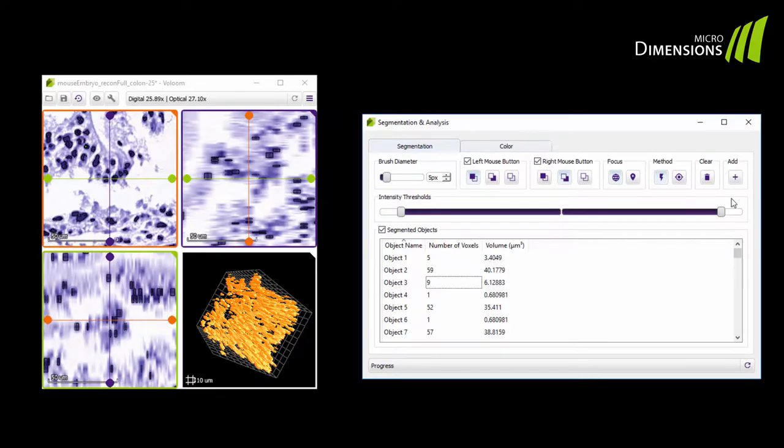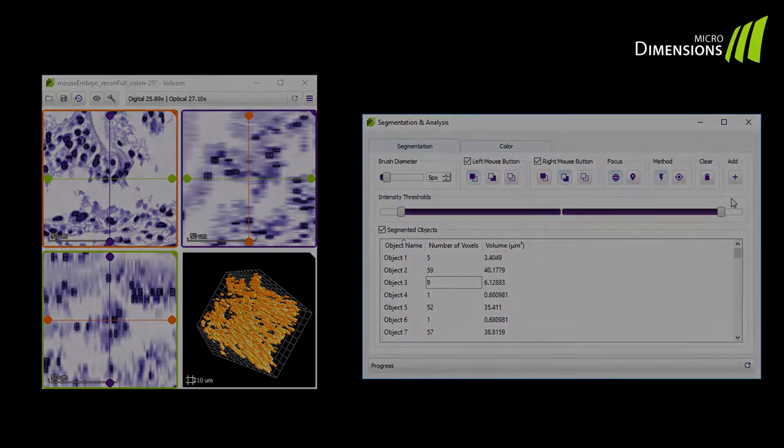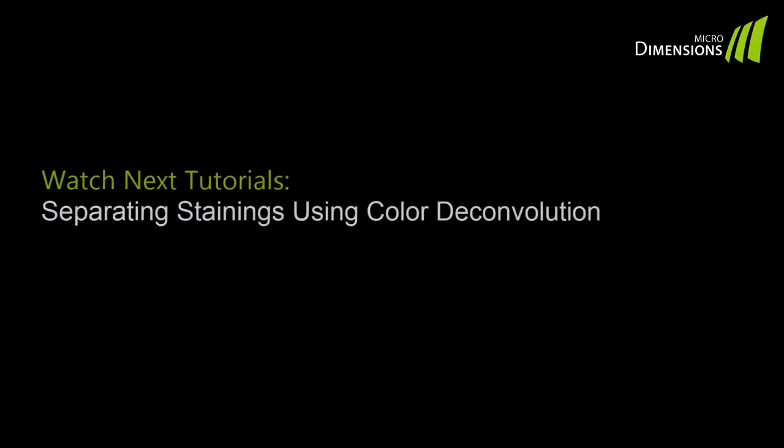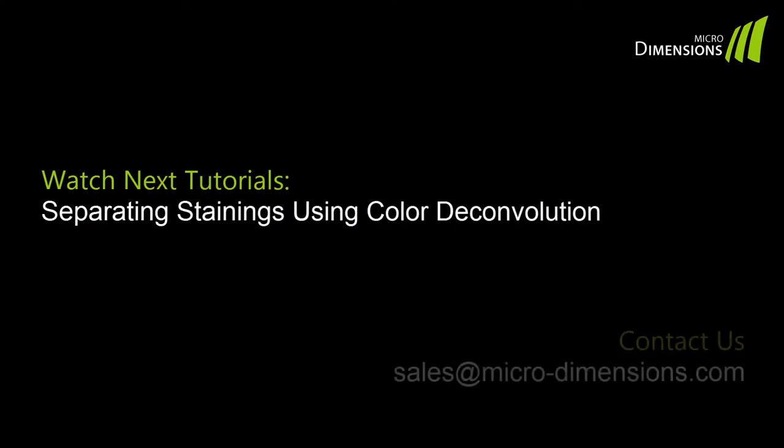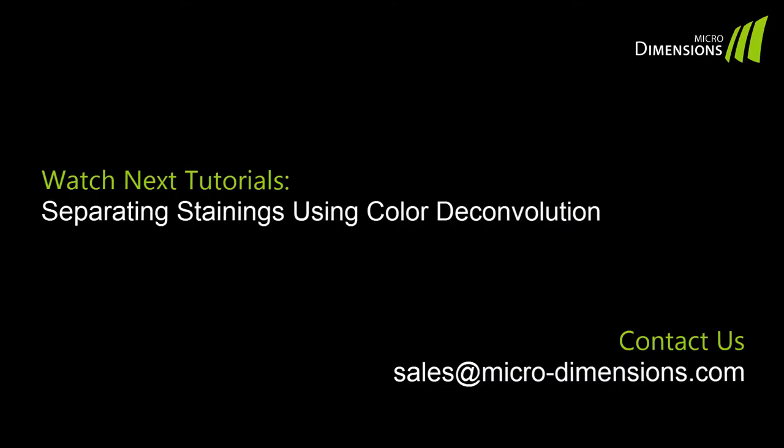Now you have mastered the segmentation and analysis tool. For more information about color deconvolution or exporting data, watch the other videos in our Volume tutorial series. Please feel free to contact us for individual questions and pricing information.